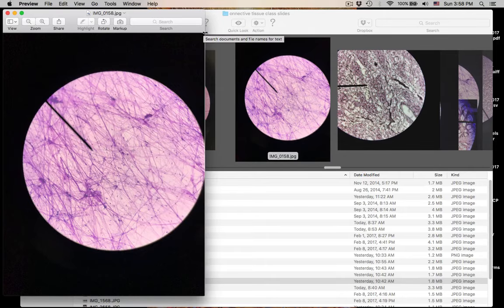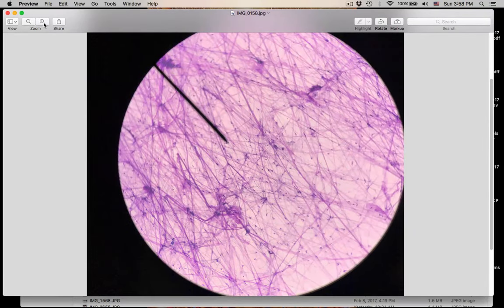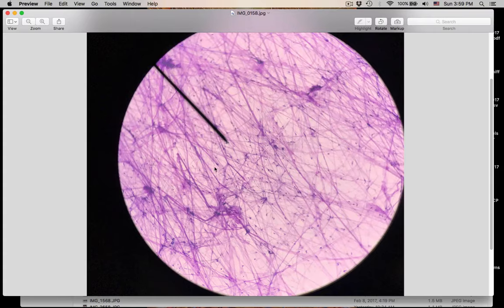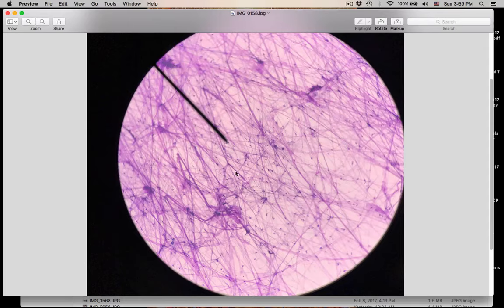Number sixteen. What is this connective tissue? And tell me the name of the scattered little nuclei we see all throughout here. Most of these nuclei belong to what cell? That cell is making the protein fibers and the ground substance in this connective tissue. So what cell type is living in here? That was number sixteen.